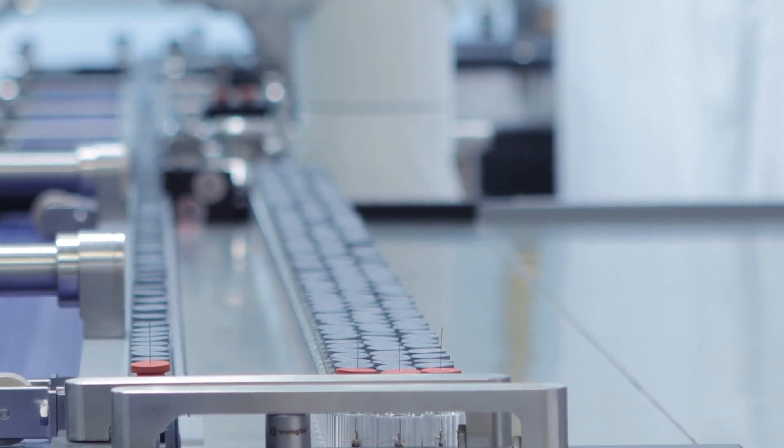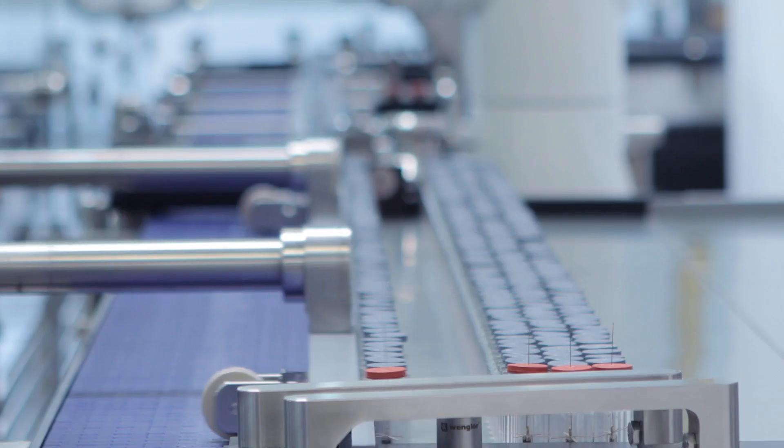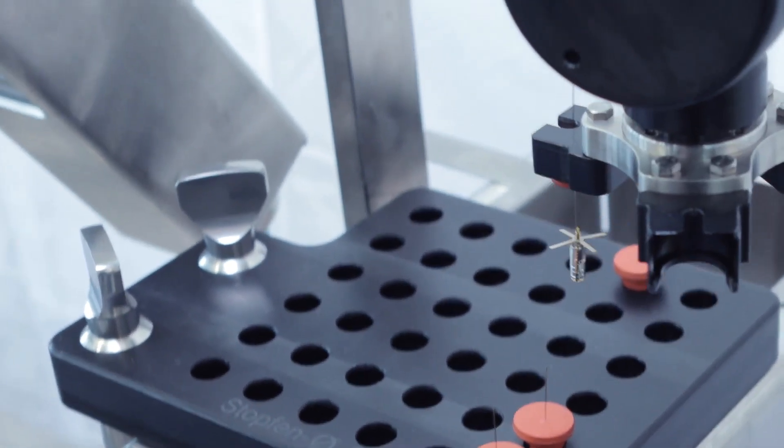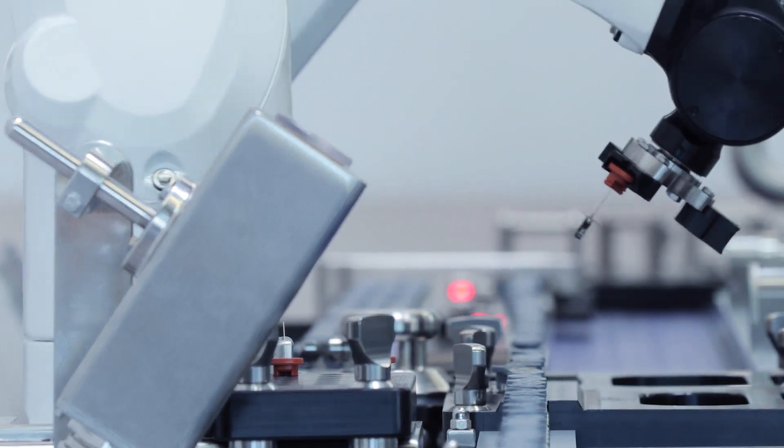The modern filling lines of Hofsunder Anlagenbau use a robot for sterile insertion of Tempris wireless temperature sensors into vials for process control at critical positions.